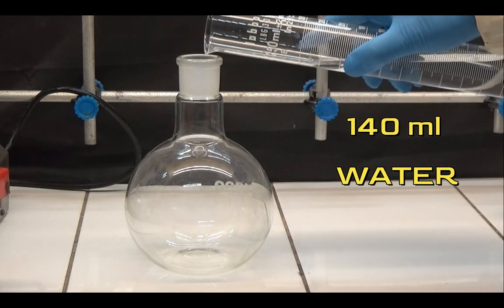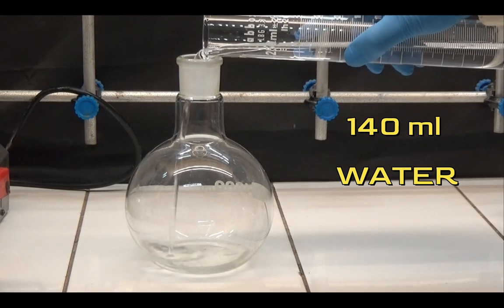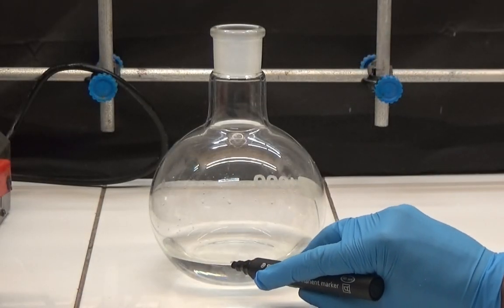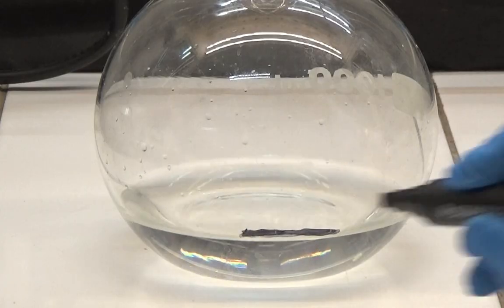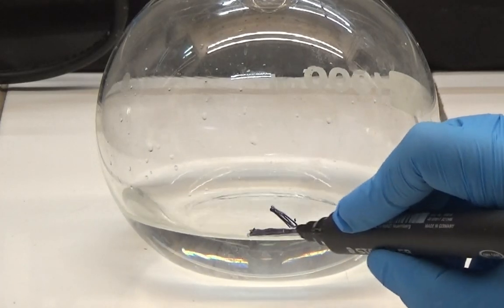First, fill a 1000ml flask with 140ml of water and mark it with a glass marker. This mark will be the volume limit for evaporation.